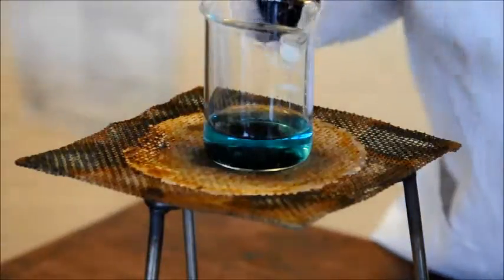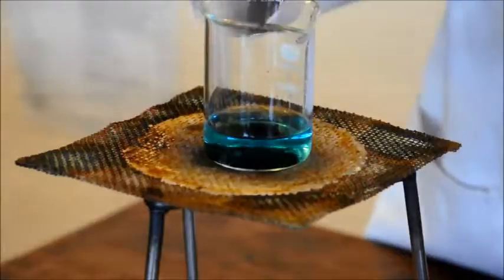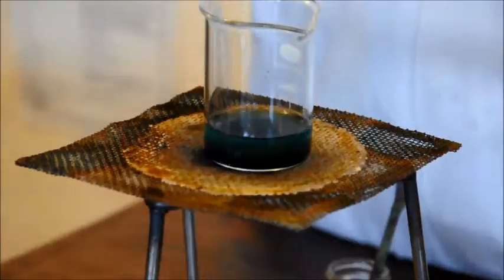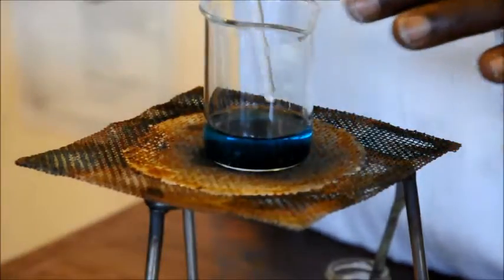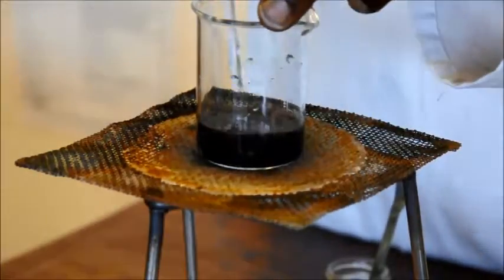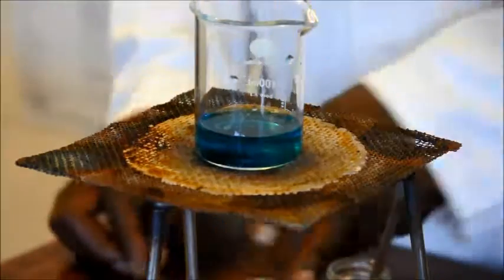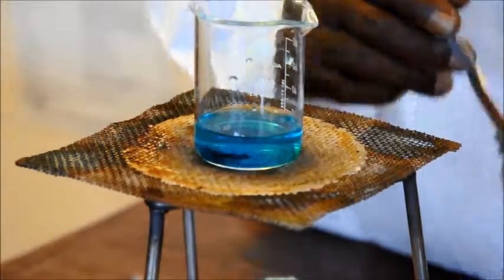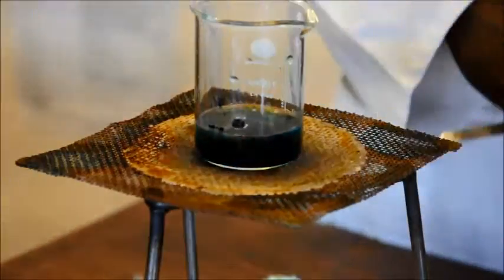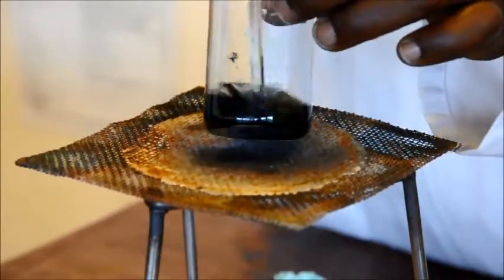Now I can still see that that solution is just fairly blue, there's no leftover black, so I'll add a little bit more of the copper oxide. And I'll keep on doing this until the copper oxide fails to react. Now I think I'm about at that point, so I'll give it a stir with the glass rod. I can see that the solution is mostly blue, with a little hint of black unreacted. So I'll add just a little bit more to make sure. Good. There we go. And give it a stir to make sure it has every chance to react.